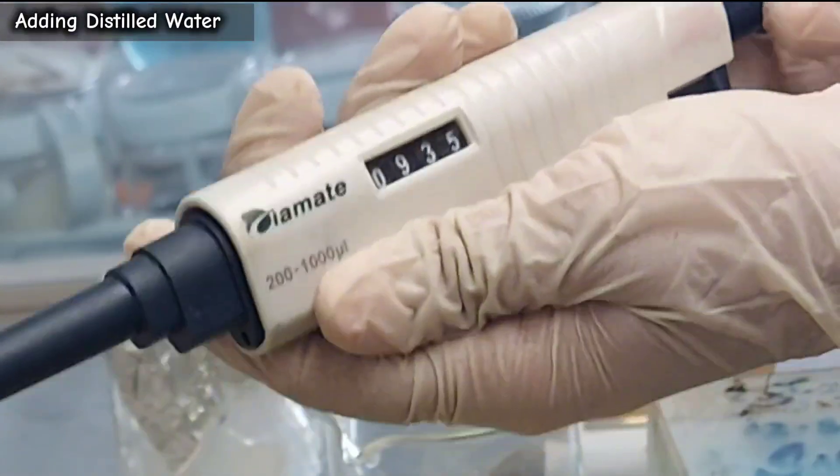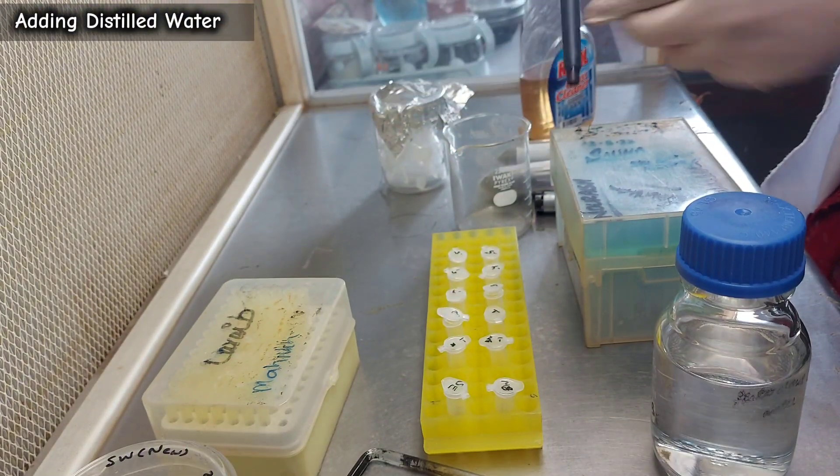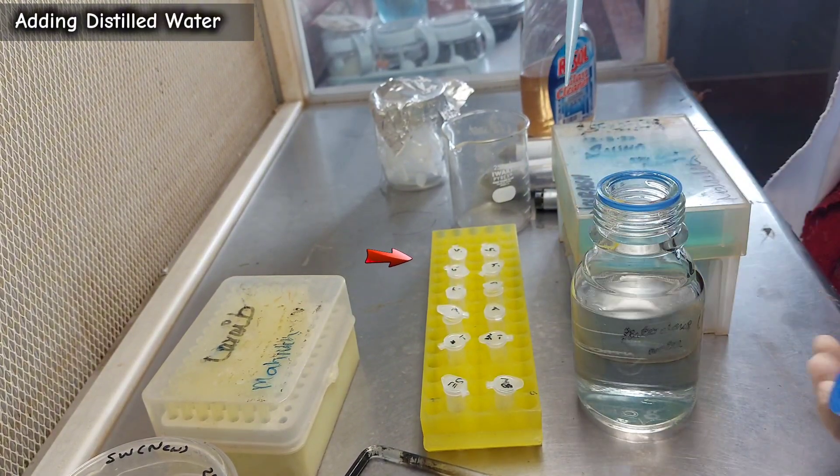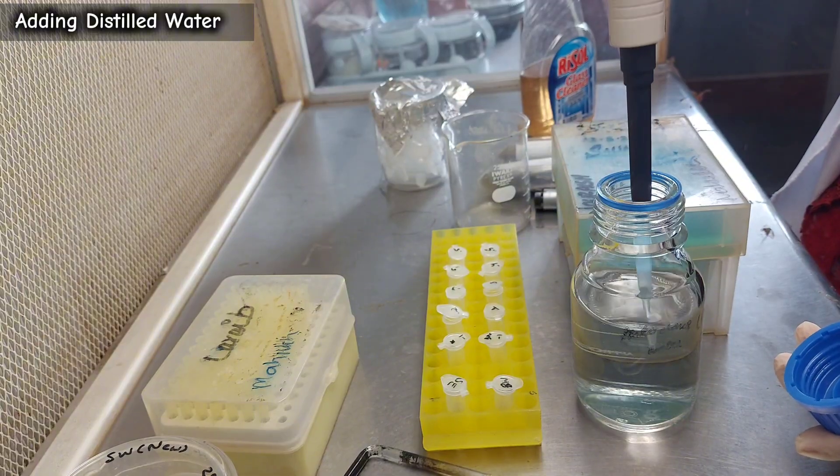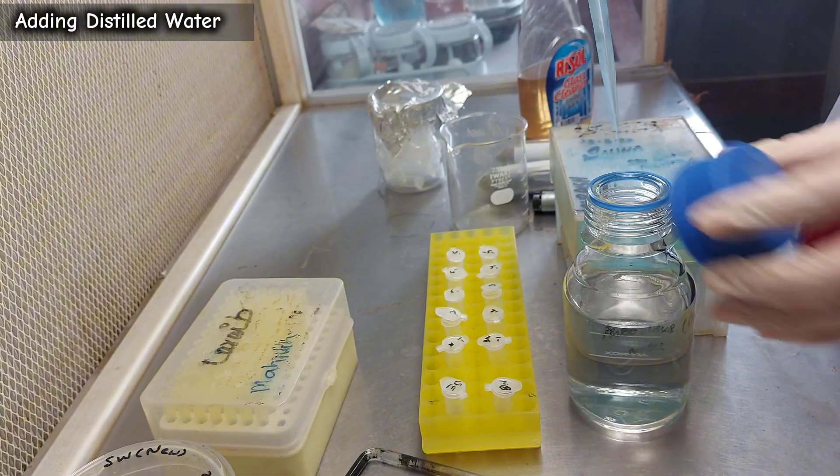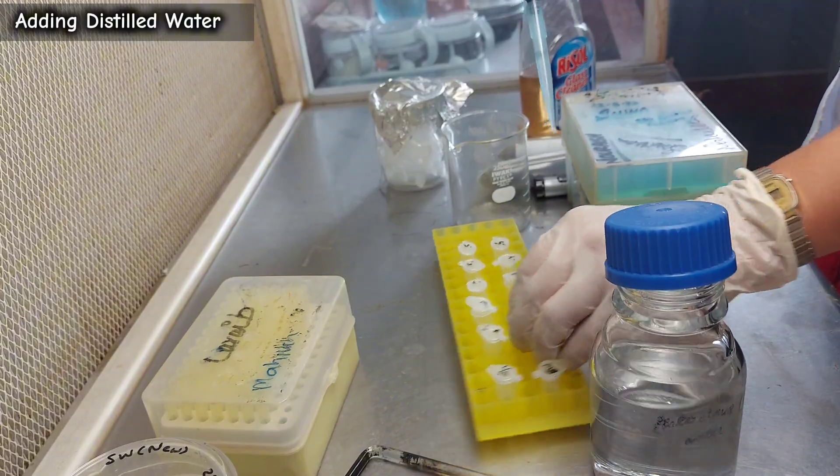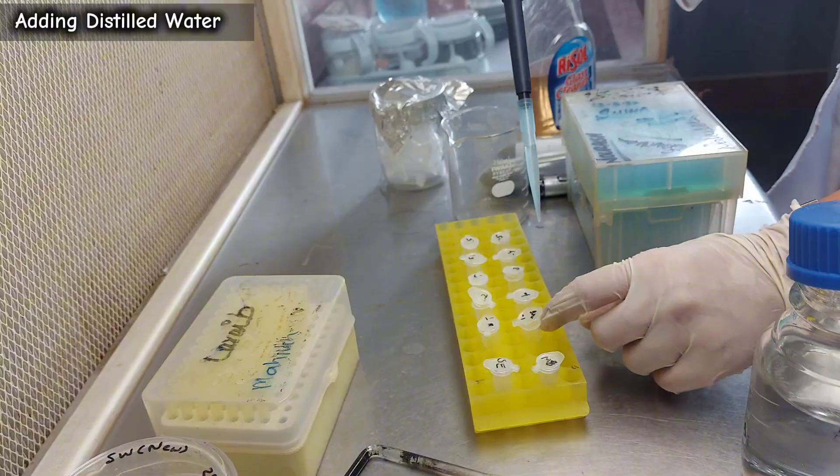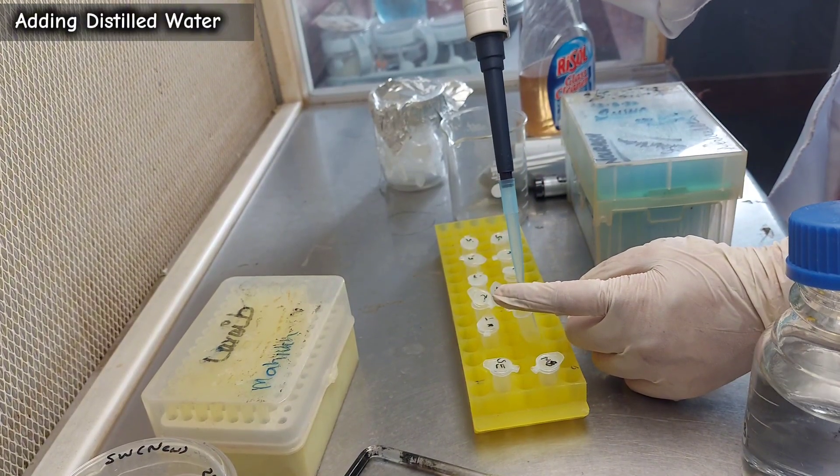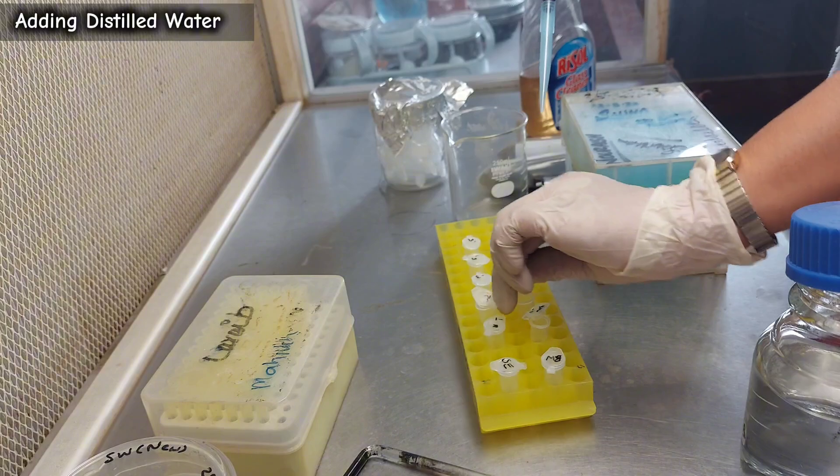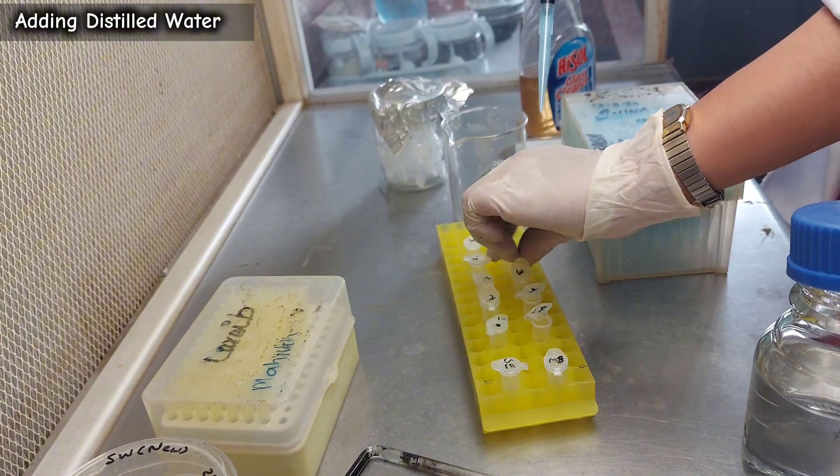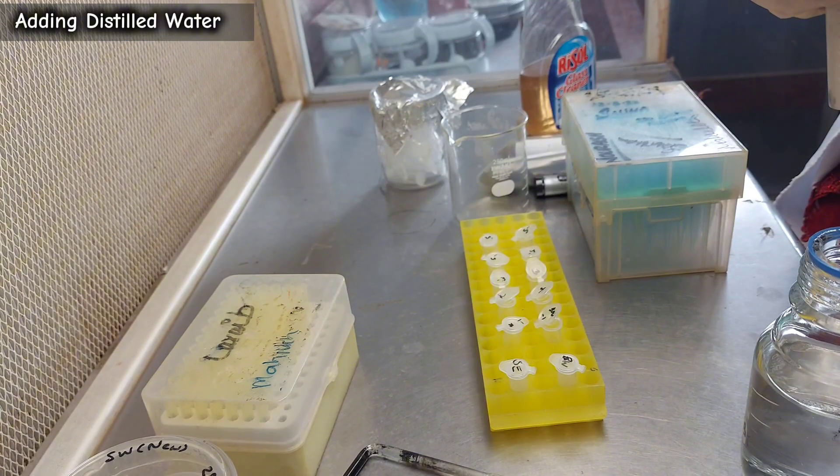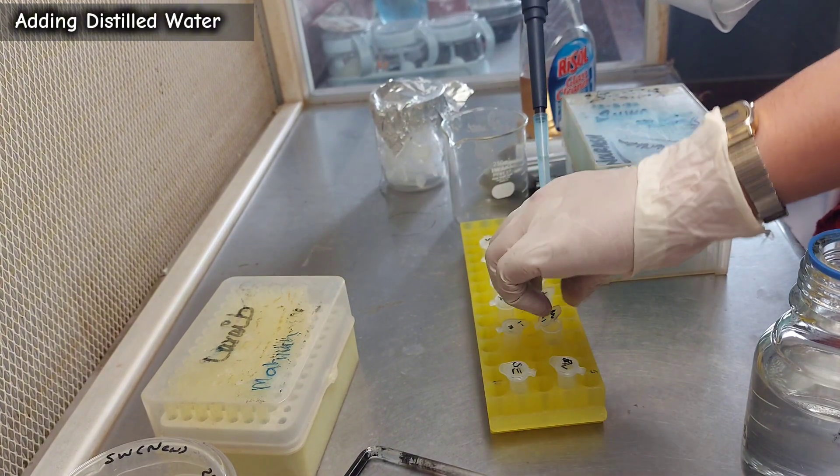Next, add 900 microliters of distilled water to each of the dilution tubes labeled 10 to the power of negative 1 to 10 to the power of negative 5. Tip: you can use the same tip for this step if you avoid touching it to any surfaces.